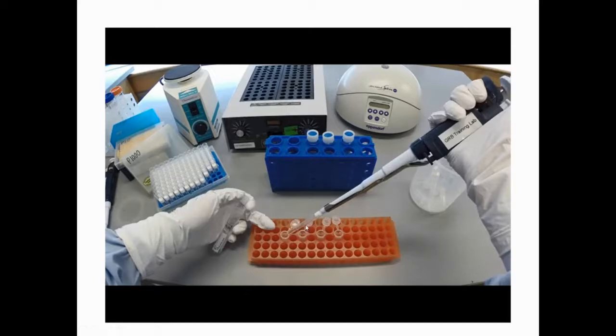And then when you're going to release the solution inside the tip, of course the tip has to touch the wall of the tube. You go to the bottom and touch the wall, and then slowly depress the plunger to release the solution until the first stop, and then you quickly depress the plunger again to the second stop, and in the meantime you quickly remove the micropipette so that you can dispel every single drop inside the pipette tip into the tube.